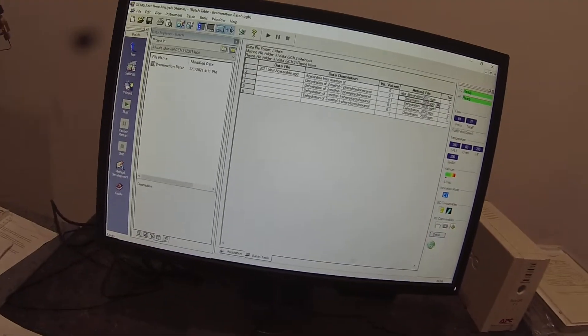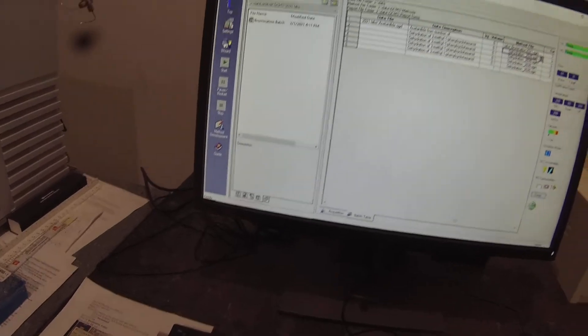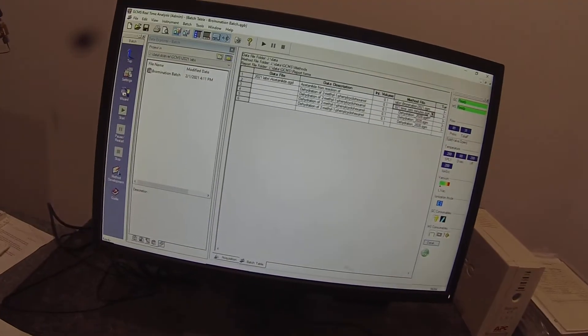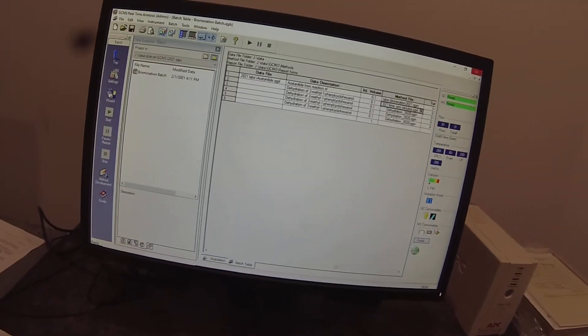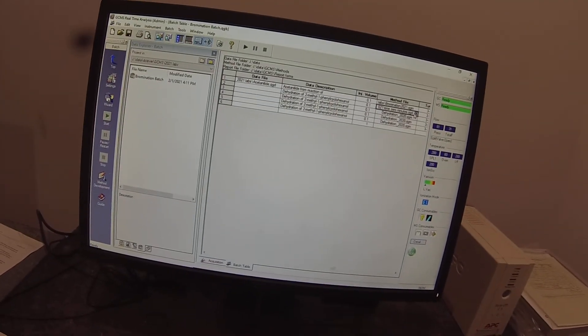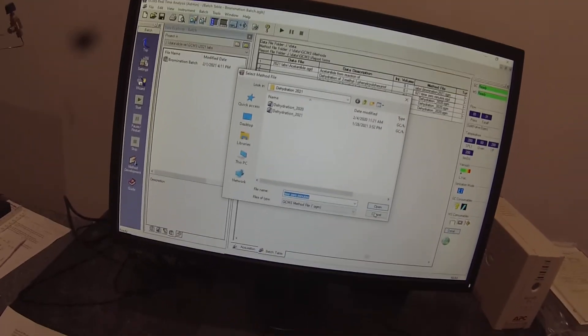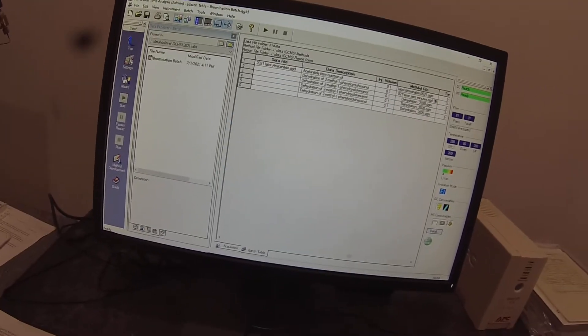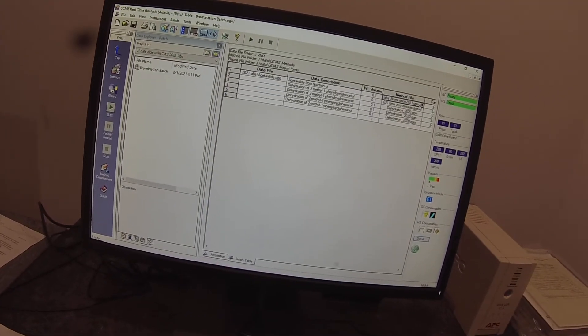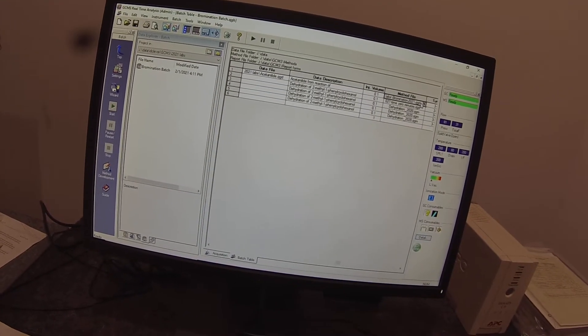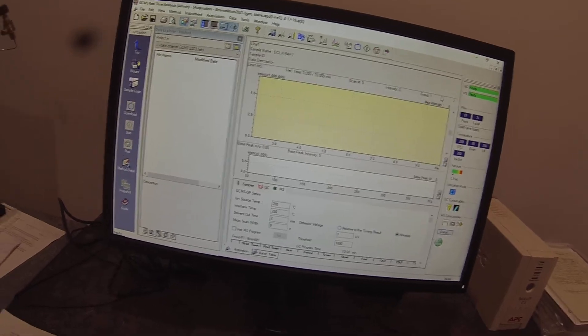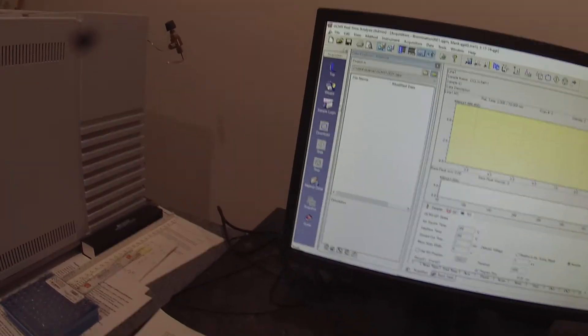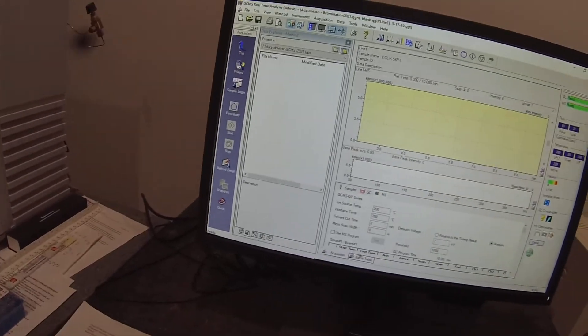And we're actually just going to copy and paste that method down into the other rows. Now it's misbehaving. It's being a pain in the ass.